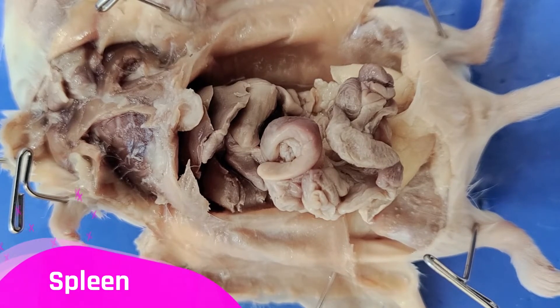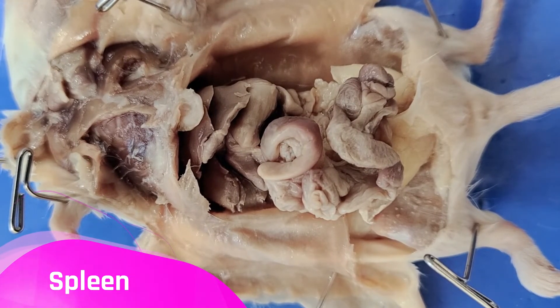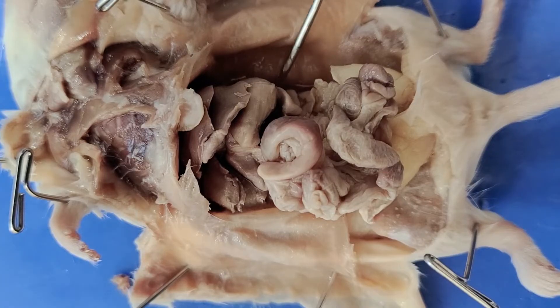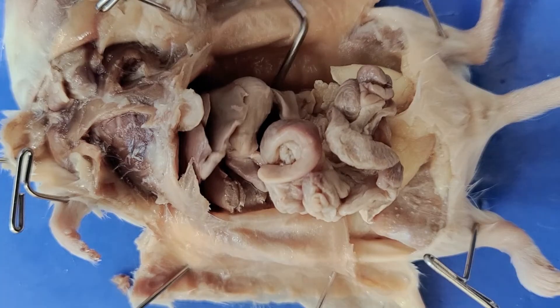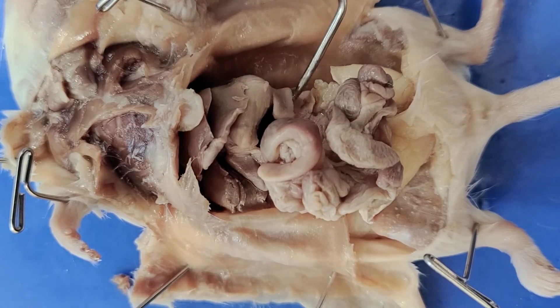Next to the stomach, we can see the spleen, which is this structure on the side right here. The spleen plays an important function in the immune system, and also plays a role in breaking down old blood cells.